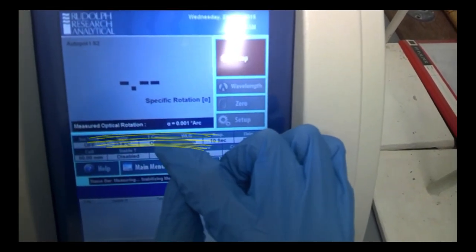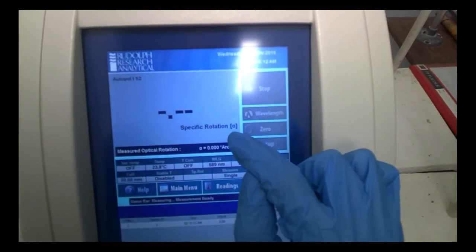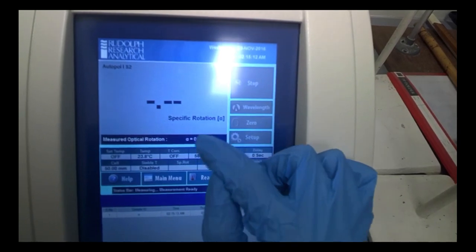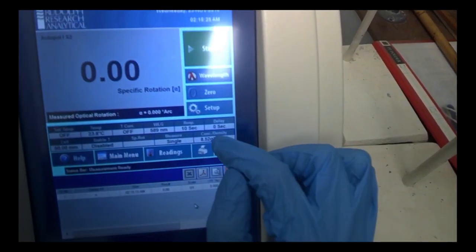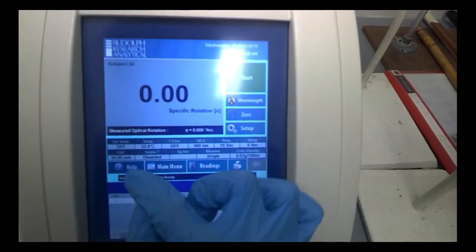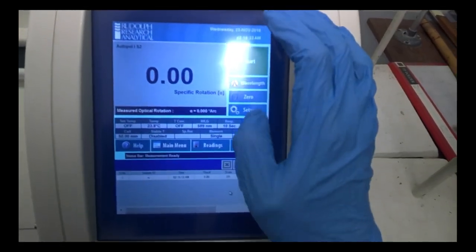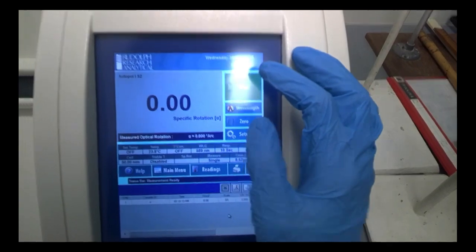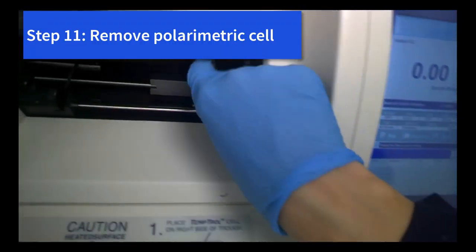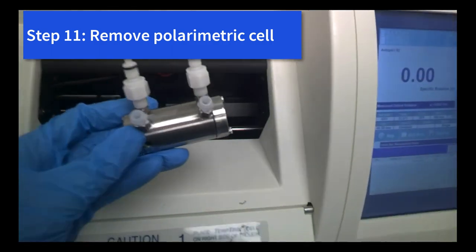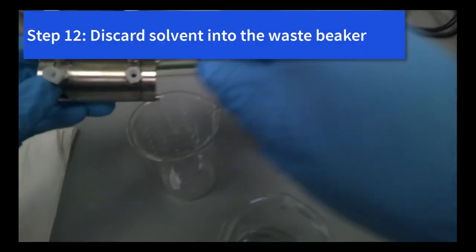And you wait for a while, the control panel will say stop later, and you see a reading that indicates a specific rotation. Now guys, you know that here they also tell you the measured optical rotation, and how are these related? The specific rotation is linked by a formula: you divide the measured optical rotation by the cell path length and the concentration. So in this case, we key in the cell path length and the concentration, and the machine will tell you the specific rotation. And now, it should be zero. There's no chiral center, so very good.